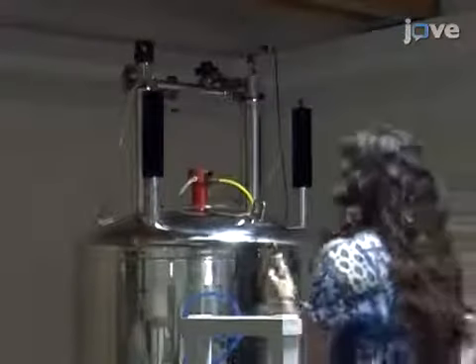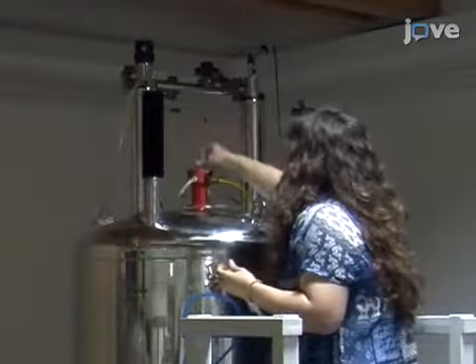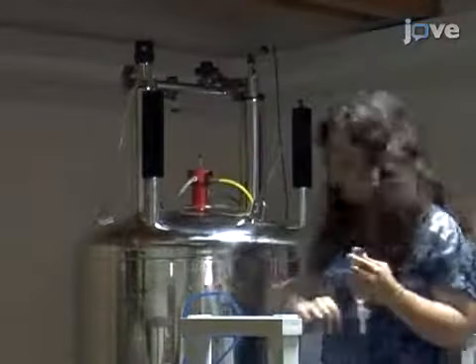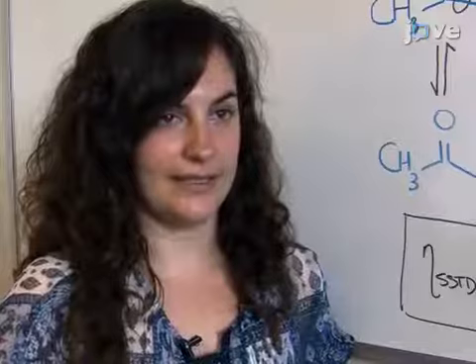To set up the SSTD NMR experiments, first insert the sample in the magnet. One of the key steps in a SSTD NMR experiment is the temperature control, so be sure to let the sample stabilize at the selected temperature for at least 20 minutes.